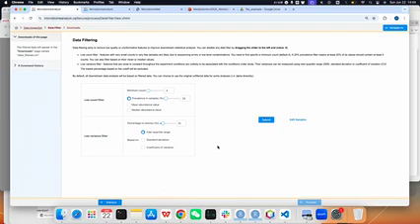So we want to remove those data that might be low count. If the count is quite low, it might be a sequencing error, or it's not the main contributor.